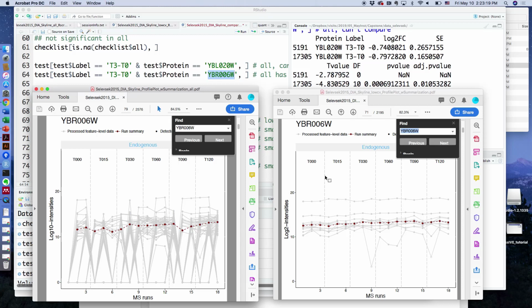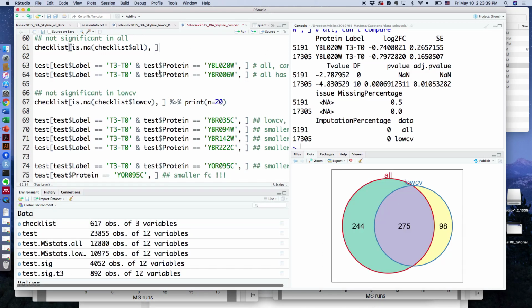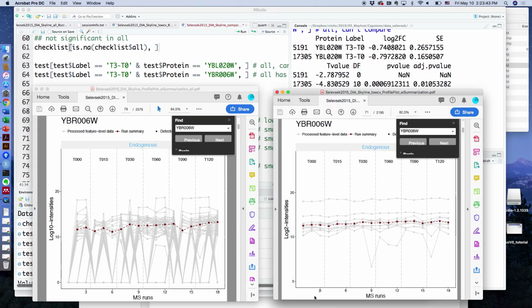So basically, those lower ones are peptides that you got rid of because their error was so high. Exactly. So now you're just summarizing the best peptides. Right. And if you see here, this is quantified, and here is not quantified, because of another kind of calculation. So the final conclusion for that specific protein is that when you get this CV correction, it's more accurate from a quantitative perspective. Absolutely.